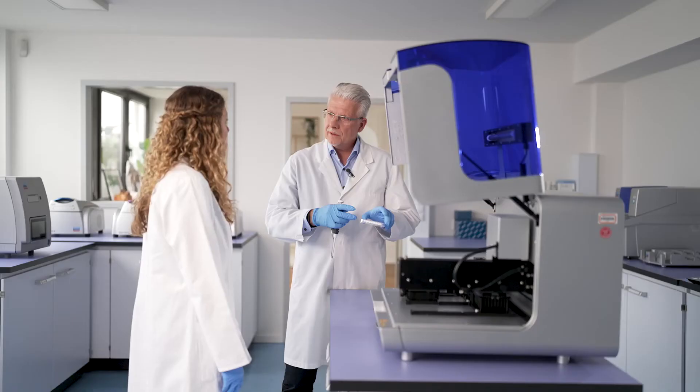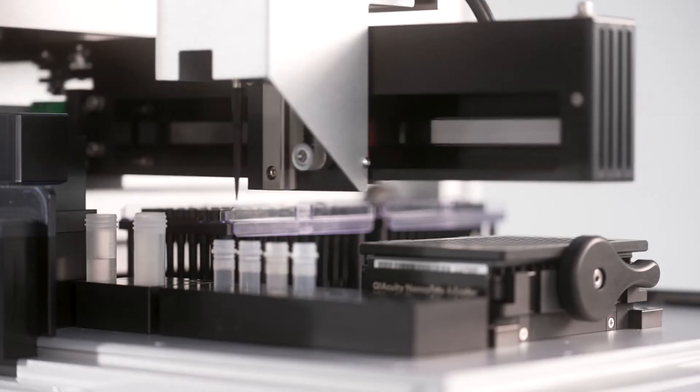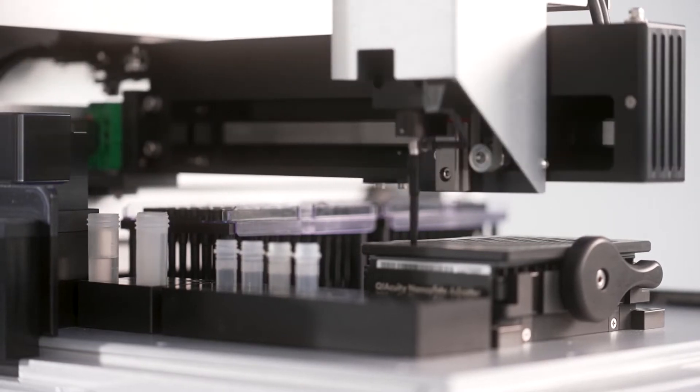Well, that looks very easy, but don't you need an additional plate for mixing the sample with the reaction mix? No, actually, you don't. The ChiAgility is mixing your sample with the reaction mix while pipetting into the nanoplate. Wow. While not making mistakes during pipetting.